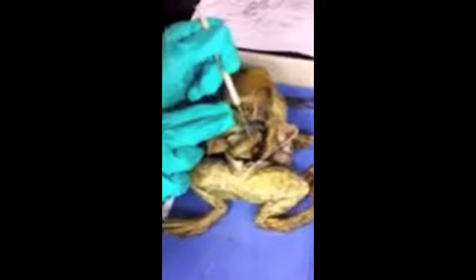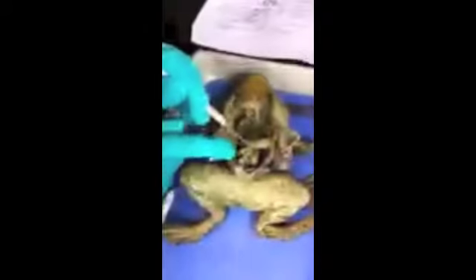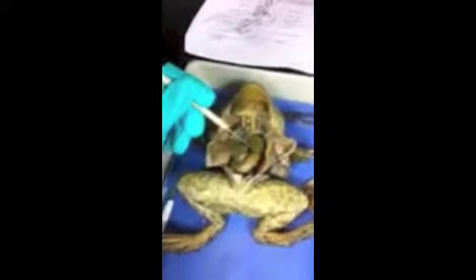Right here is the stomach, and it leads to the small intestine, which is right here. The stomach is a temporary storage tank where chemical breakdown of proteins begins. The food is changed to a chyme, which is a creamy paste.